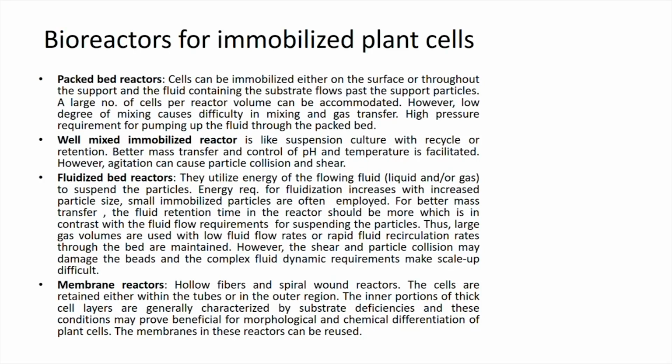You use the cells and make them freely suspended in solution. So, they become like reactors with cell retention, and there the limitation of external mass transfer can be avoided.